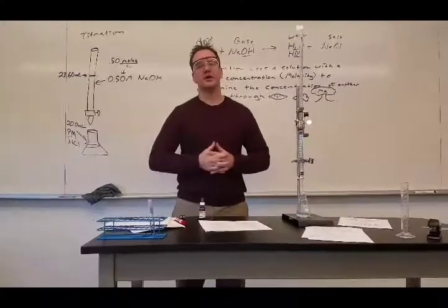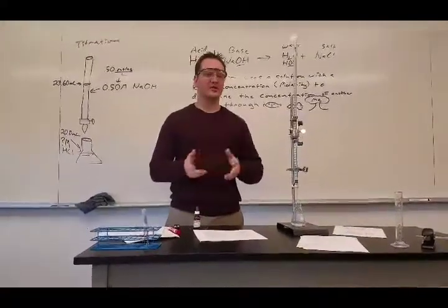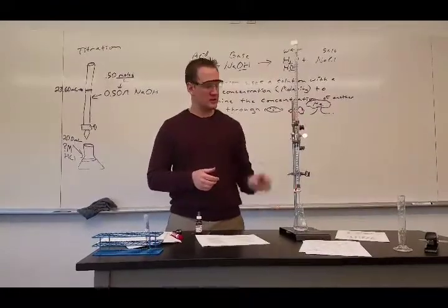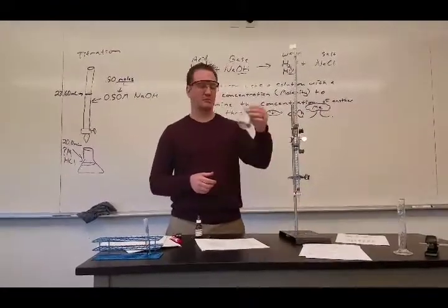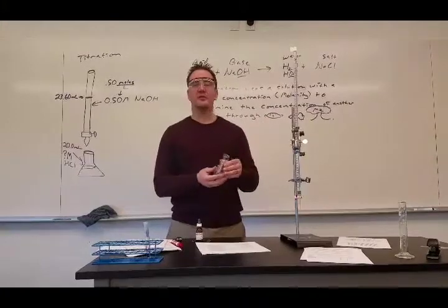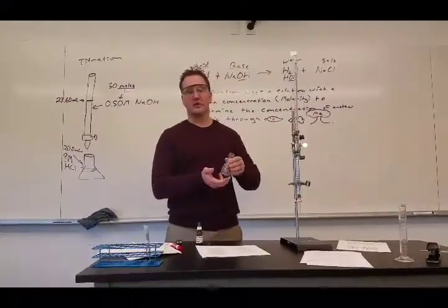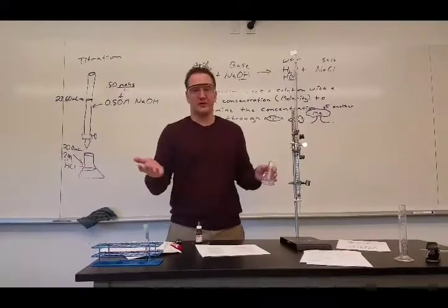In this video we're going to talk about titrations. What a titration allows us to do is to use a solution where we know the concentration to figure out the concentration of something that we don't know. For example, in this titration we're going to look at this sample of hydrochloric acid. It's a 20 milliliter sample and I don't know its molarity.